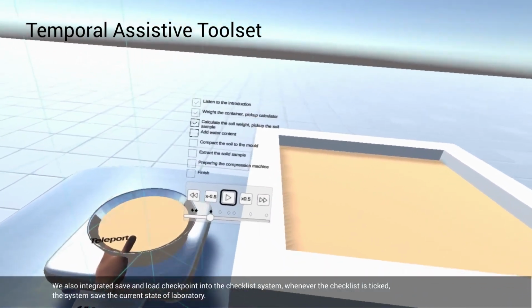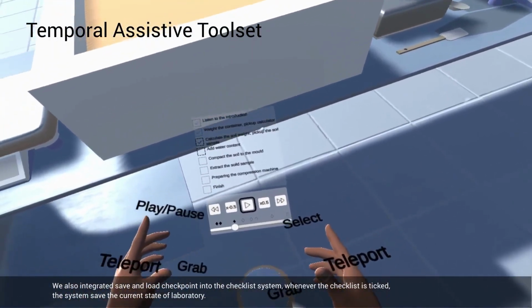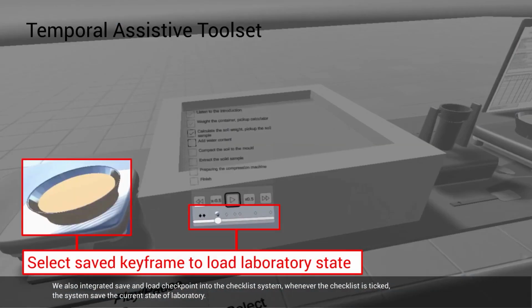We also integrate save and load checkpoint into the checklist system. Whenever the checklist is ticked, the system saves the current state of the laboratory. The students can load the saved state by selecting the associated keyframe on the progress bar.